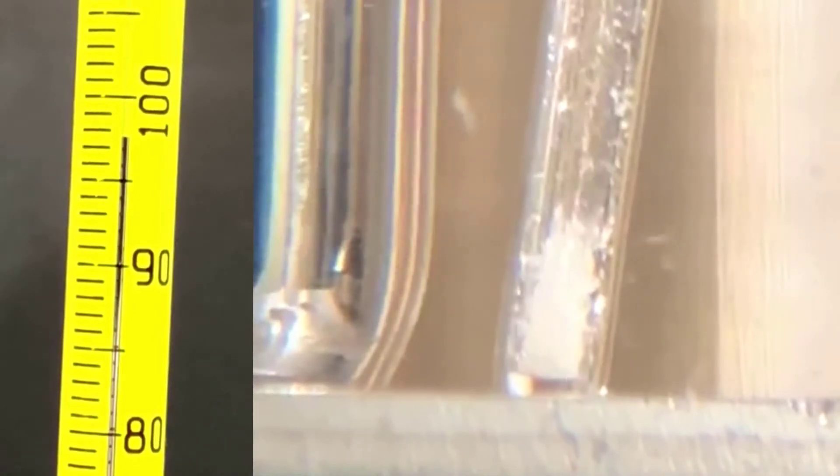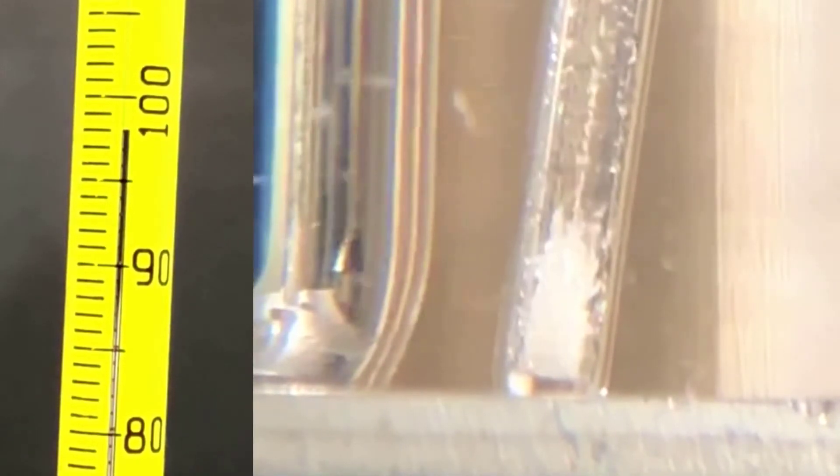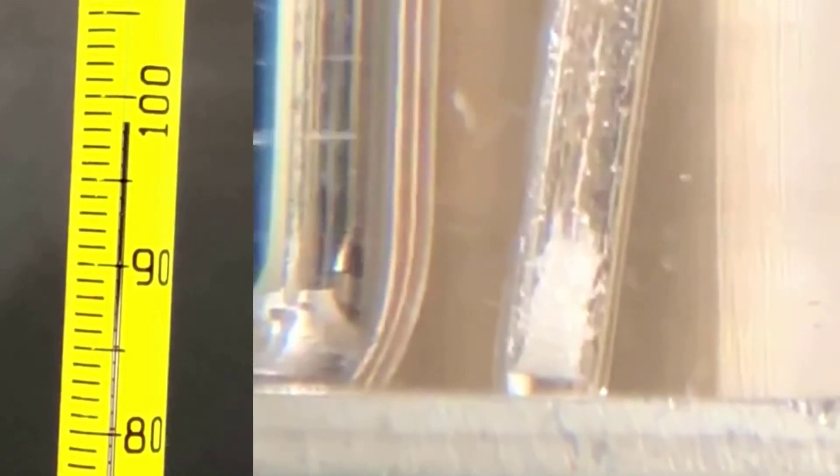Then, when the last bit of solid disappears and it's all liquid, record that temperature as well. The melting point range represents a slushy state of the material where solid and liquid coexist. The range can tell you about the purity of the sample. If your melting point range is greater than about 4 degrees, it indicates your sample is probably not pure.